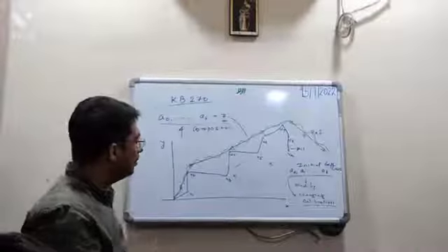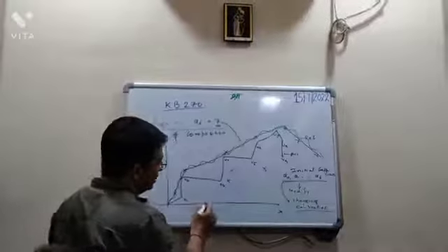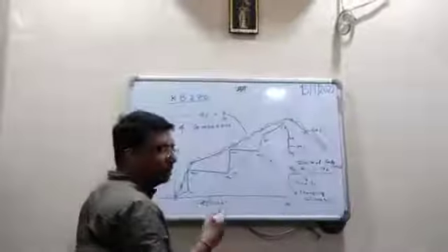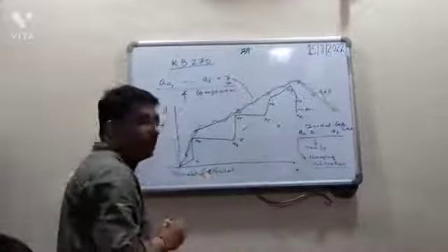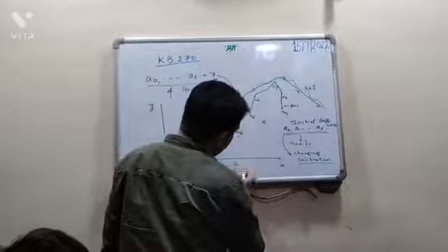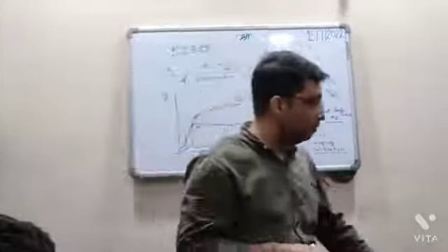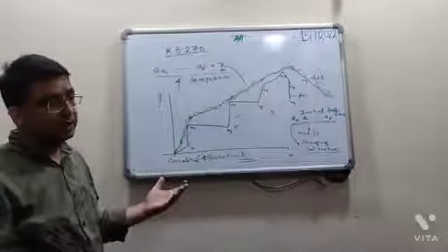Clear? Okay. Now what another point which we have not discussed in the last discussion is the coefficient of correlation, the correlation coefficient. This is a very important parameter which is there in calibration. Without this coefficient of correlation, you cannot say how accurate the calibration was done.